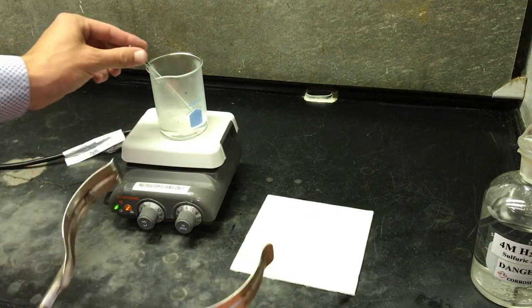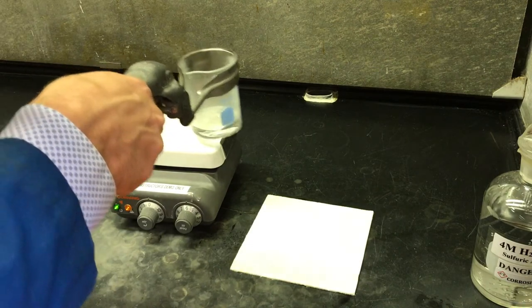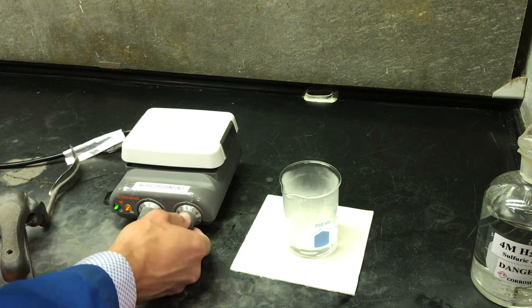Now that the solution in our reaction beaker is hot and clear, we will remove it from the hot plate with beaker tongs and place it on an insulated pad.